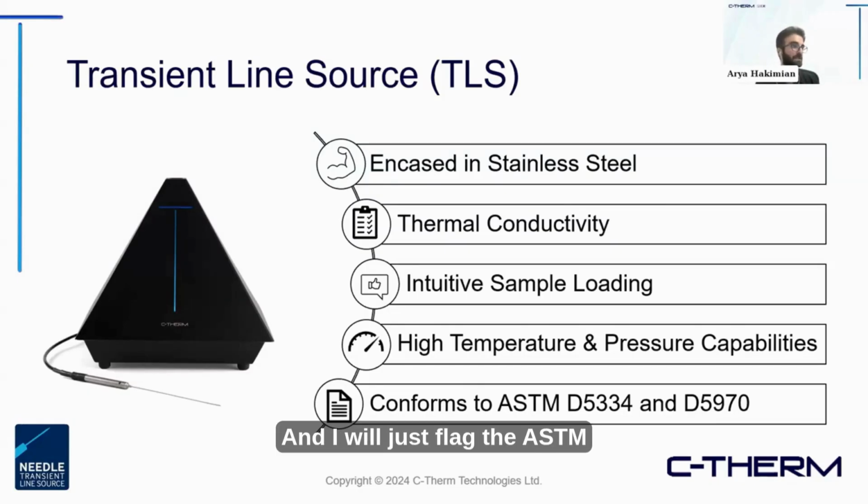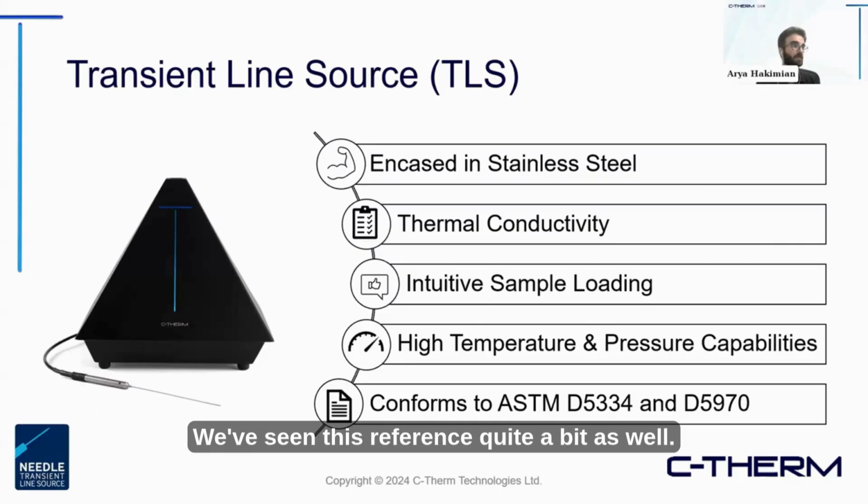And I will just flag the ASTM D5334 standard. This is one that is related to geological core soil sediment samples. We've seen this referenced quite a bit as well. There is a dedicated ASTM specific to that application space with this technique.